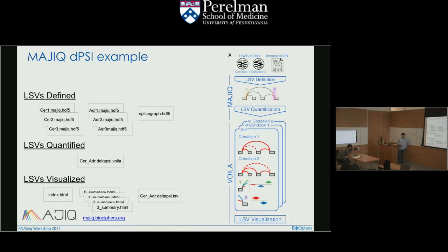And really, technically, MAJIQ can work if you just give it the boundaries of genes. That's one key piece of information we use from the GFF3 file. Where does the gene start and end? And then we look for any splice junctions within that boundary and start building on top of that. So technically, if you only gave us the gene boundary, we would in theory be able to recreate the transcript without the rest of the annotation.